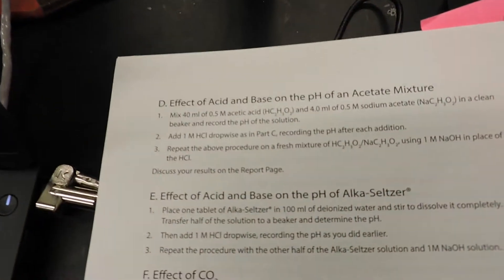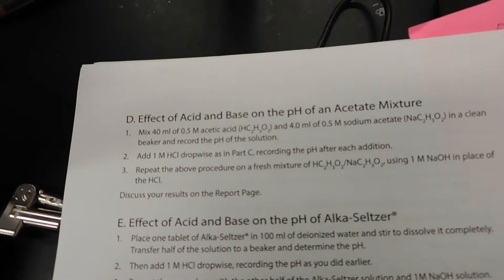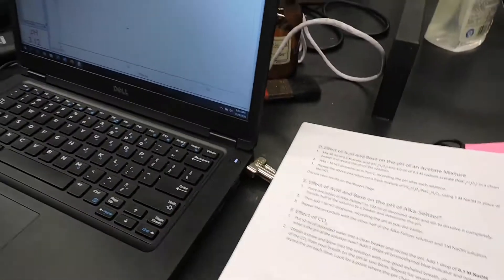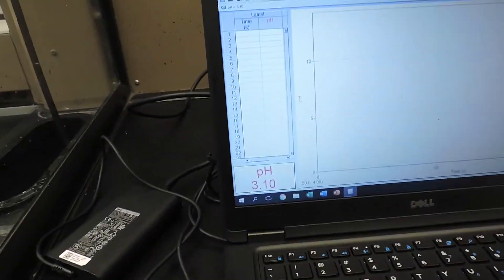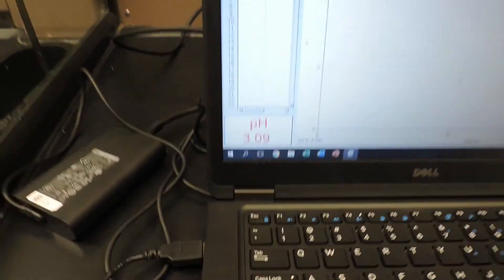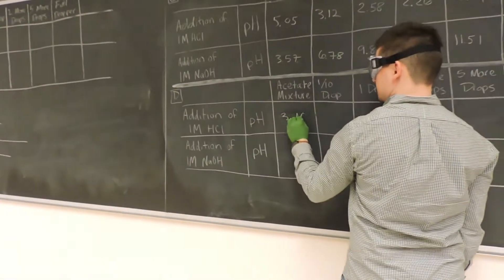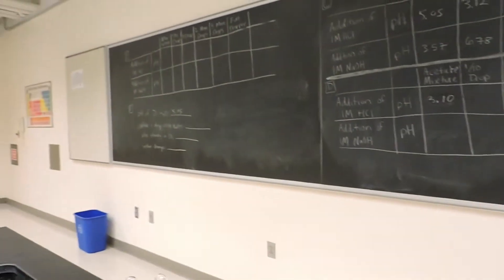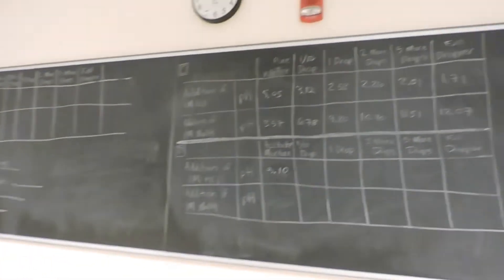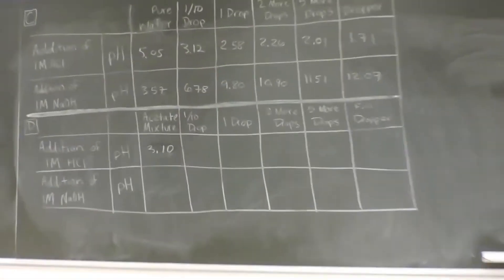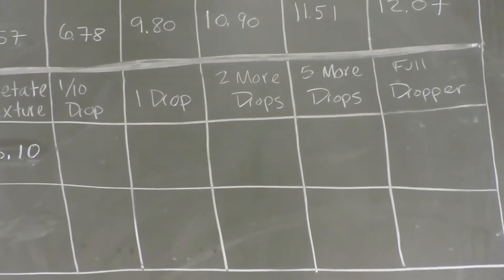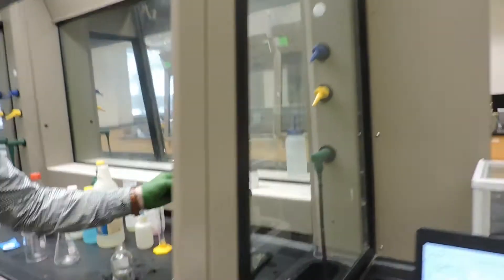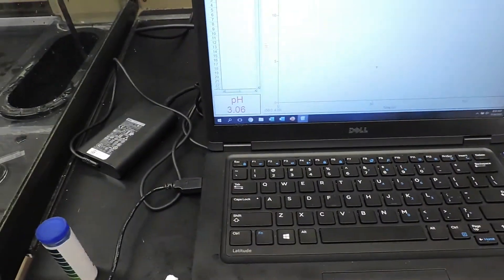Now we're moving on to part D, the effect of acids and bases on the pH of acetate mixture. We've mixed acetic acid and sodium acetate in a beaker, and we're going to record the pH initially, which is 3.10. This is for the adding the acid drop wise. We're doing it the same way we did with just the water where we're adding those specific drops of each, the acid and the base. We're going to start with the acid so our tenth of a drop goes first and we're going to see how the pH is affected.